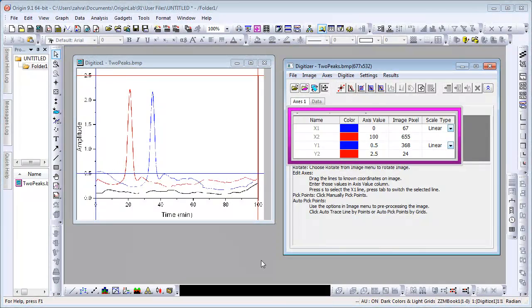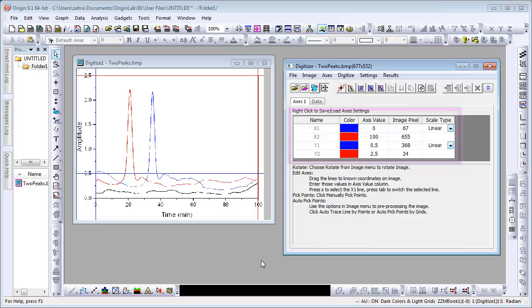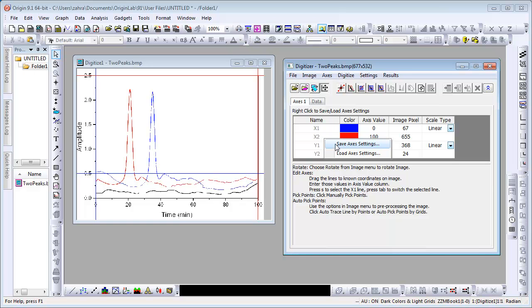Here we have already aligned the other two axes and input the values into the Axes tab. To save these settings for future use, right-click in the Axes tab and select Save Axes Settings. You can also upload previously saved axes settings by selecting Load Axes Settings.